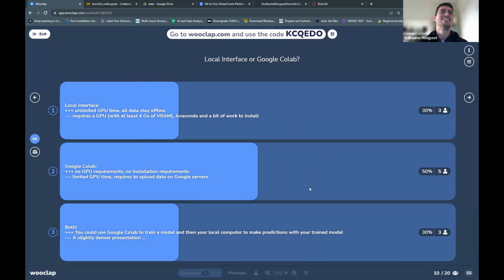Maybe it will change, but for now the dominant answer is Google Colab, which will be fine, and I will present the rest a bit shorter, if we have a little bit of time in the end. Okay, 1 or 2 minutes, maybe 1. Right, so it seems that we are decided. So Google Colab it is.